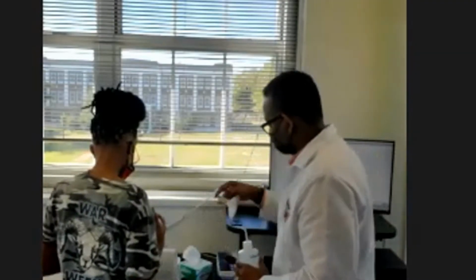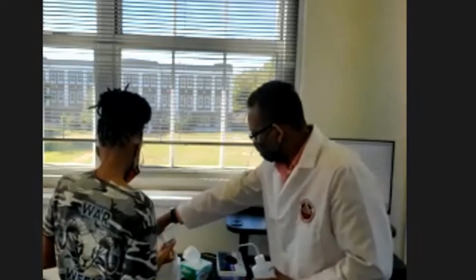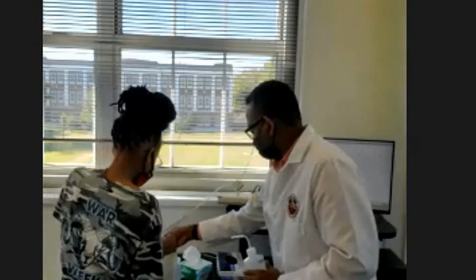Make sure that, look at the bottom. It should fit. See that one should fit right there. When you rotate it, it fits right there. Okay. Make sure to clean. Remember, this part also has soap.